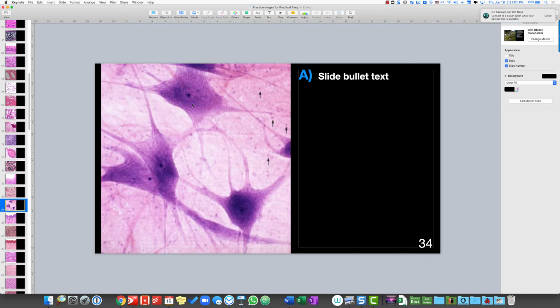Okay, this is another picture showing neurons, multipolar neurons. So please put multipolar instead of just neurons. And then kind of faint here, you can see the glial cells. Okay, and this is likely the neuron's axon.